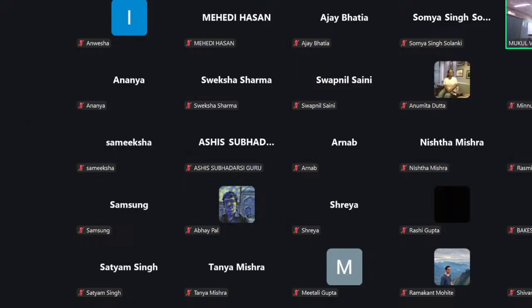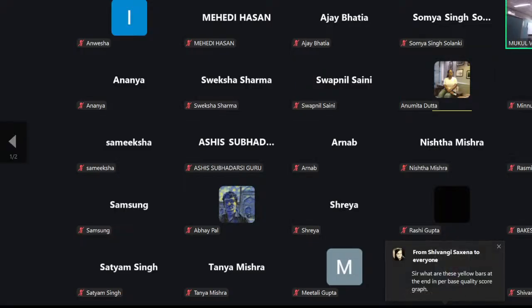Does anybody have any doubt up until now? Sir, can you please explain the GC content? The GC content, okay. The peak.